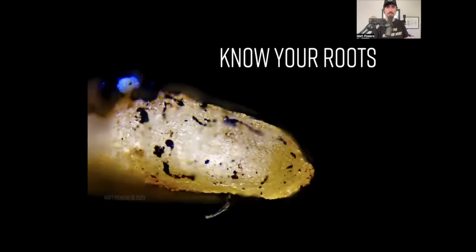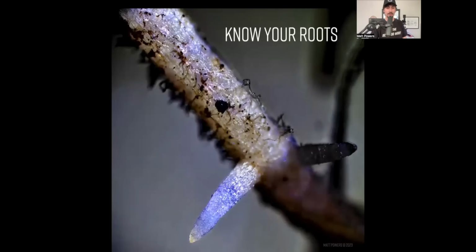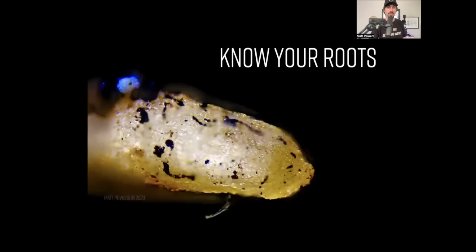This is the meristem cells. This is where rhizophagy happens. This is where the nutrients come in and out. This is where the exudates go in and out. They come out and then they get reabsorbed. So this is where all the feedback comes from and goes for the plant. And it looks very familiar. And the behavior of it is very interesting. You can see the color differentiation. Everyone can verify this. You can go look at this.